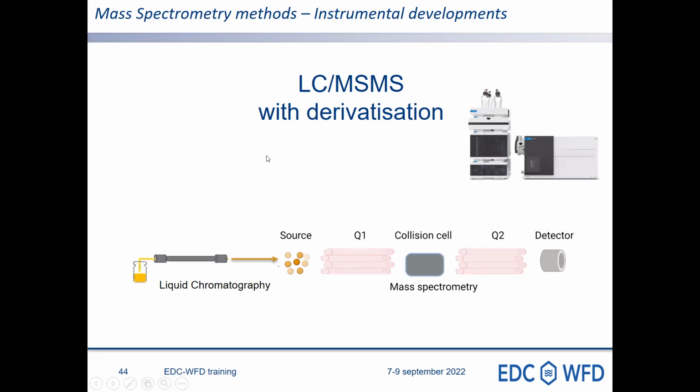You all know that estrogens are very complex to analyze in LC-MS, especially in negative mode, because of the lack of ionization rate. And there are strategies to overcome it that rely on the implementation of a derivatization approach. This has been done by some of the partners of the project.